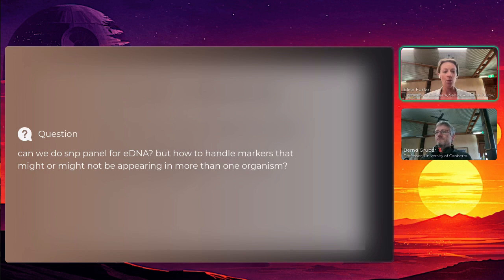So we are working with developing primers here. We've got a 20-odd base pair stretch either side of our SNP that we're trying to target. Hopefully that's going to stop it from amplifying a lot of other co-occurring DNA that you've got in there. Your biggest worry is going to be closely related organisms. So if you've got conspecifics, that's obviously something you have to look at. If you've got genomes from those co-occurring species that you're worried about, you can do a BLAST for your primers and see if it's likely to amplify in that.